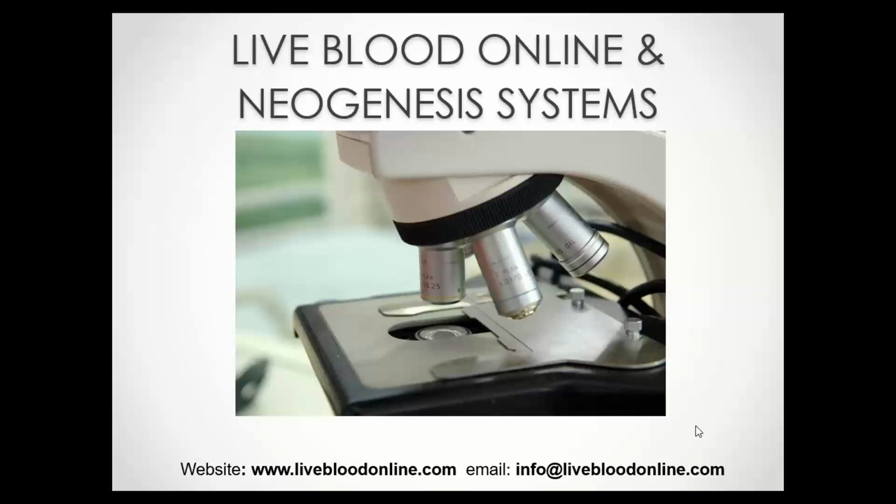We do have a video available where we showed this, and it is a good idea to have a look at it just to see for yourself how things change with different specifications on the microscope. It is a common pitfall to new practitioners, and of course having the correct equipment is absolutely crucial in enabling you to see and to use live blood analysis to its full potential.